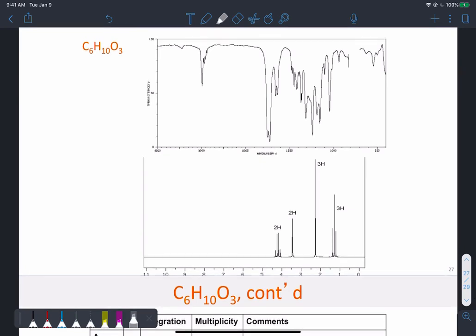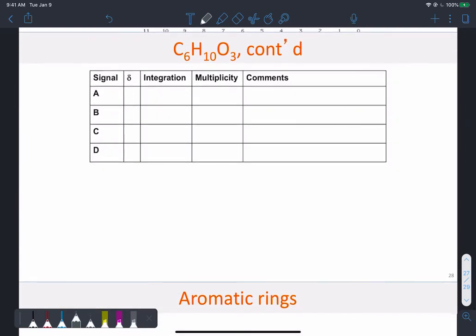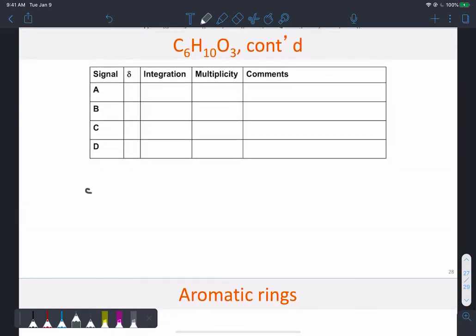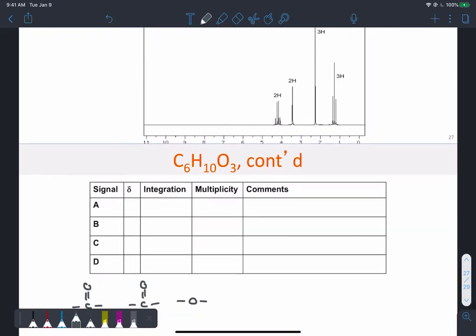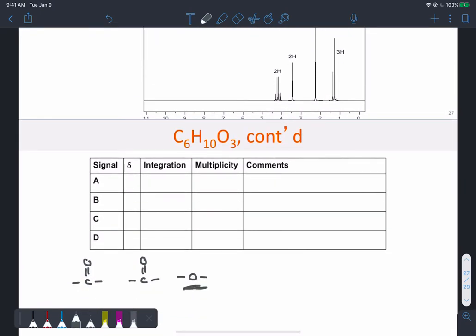All right, give a try for this one. Okay, two degrees of unsaturation. We also see two peaks of two carbonyl groups there. So three oxygen atoms in the formula. There's one, there's two, and maybe there's three or maybe there's a CH. No, I don't see any single CH peaks, so it makes more sense for it to be oxygen.